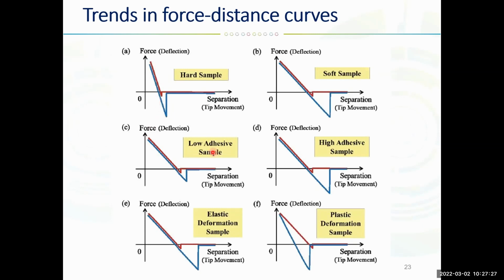If we talk about adhesive forces, adhesive samples require a higher restoring force to separate the tip and sample compared with low adhesive samples. And this is reflected in a larger amplitude in the negative direction here. You see this difference.